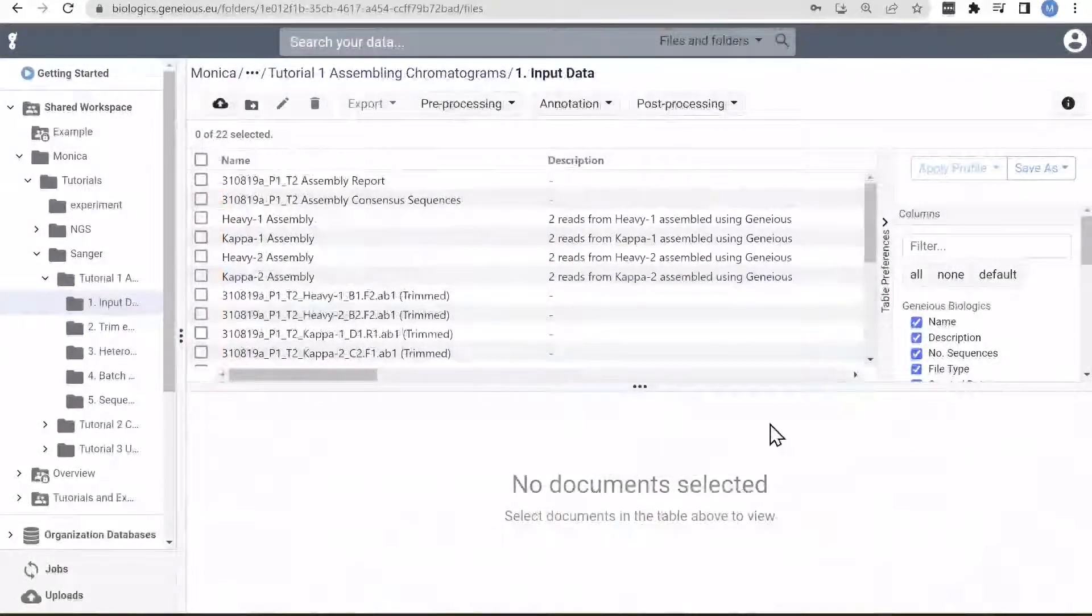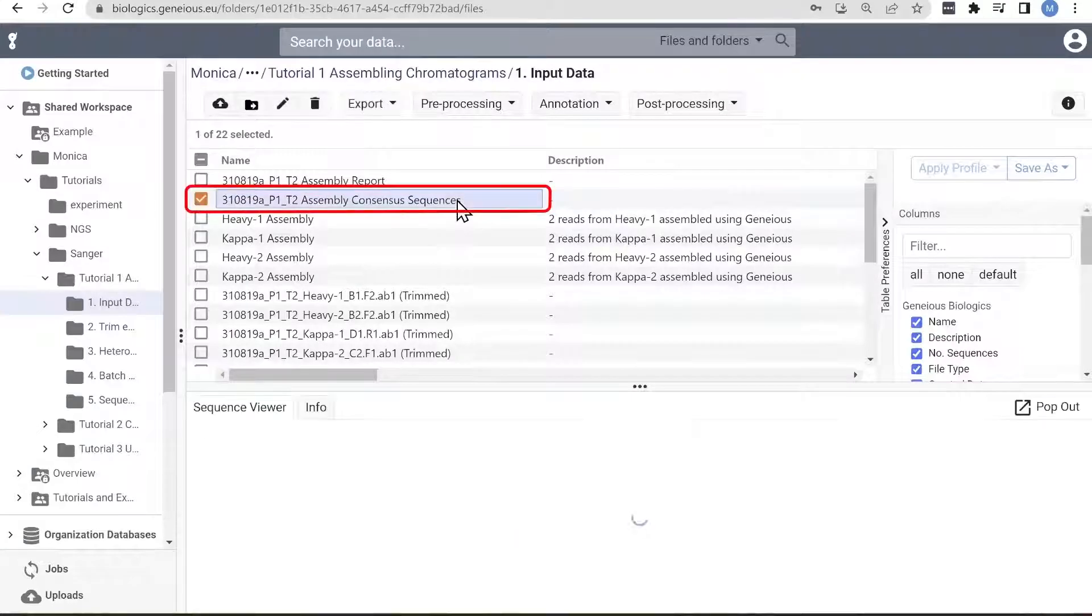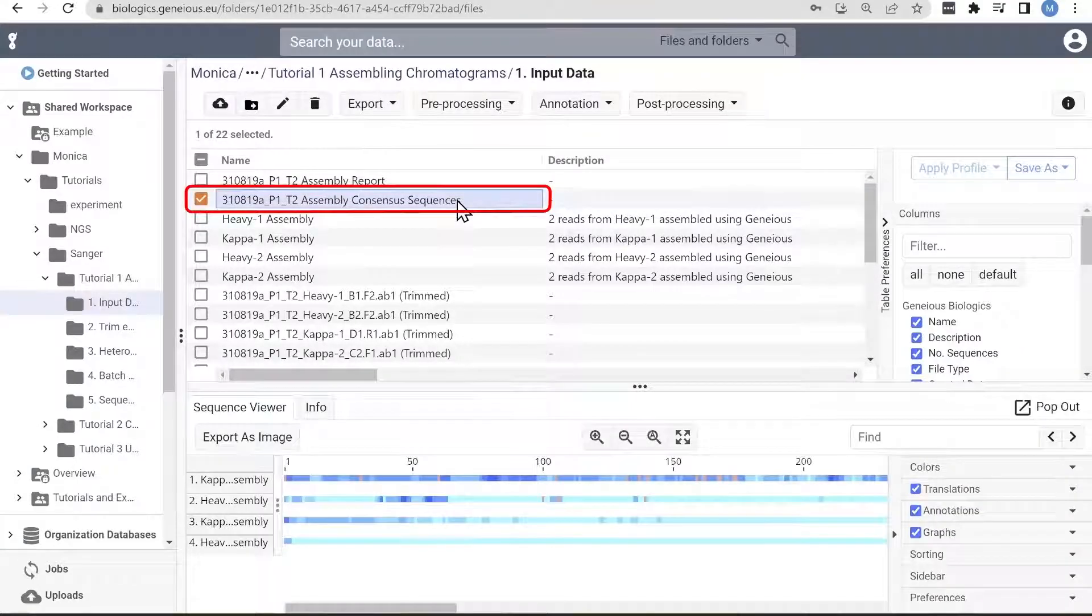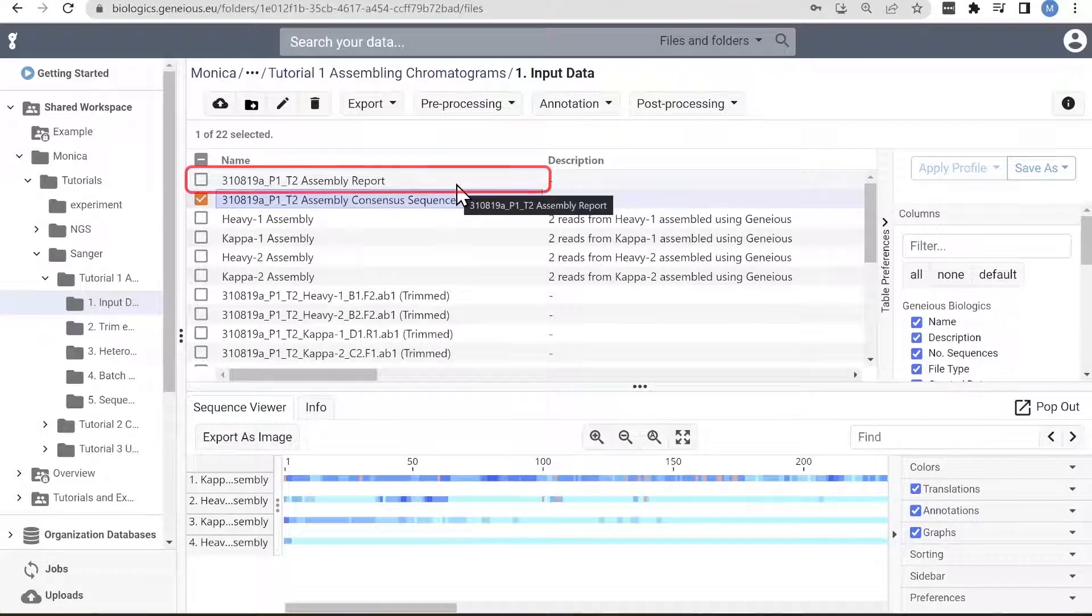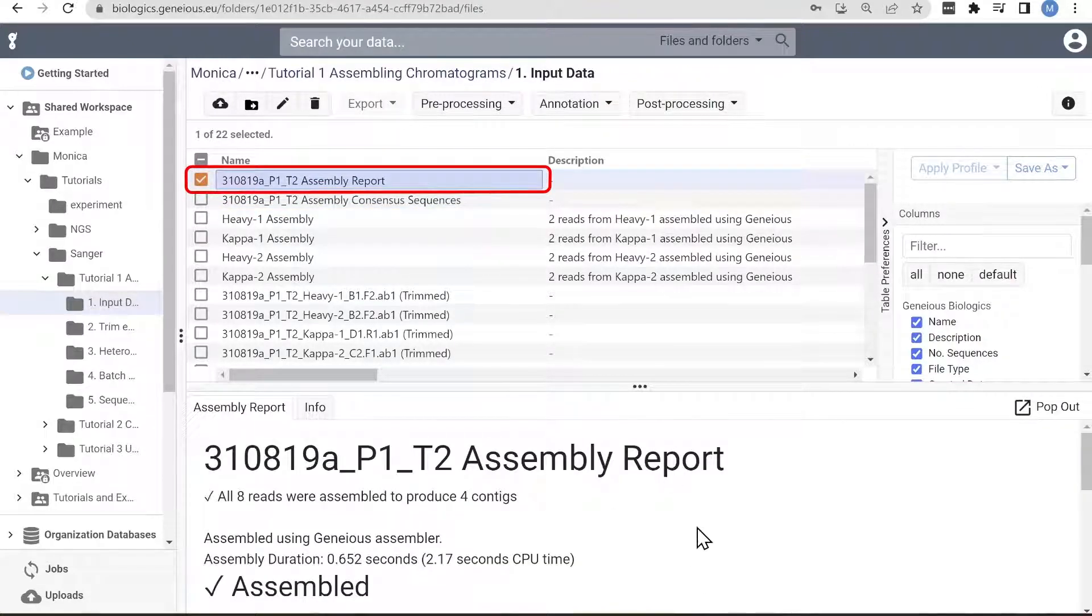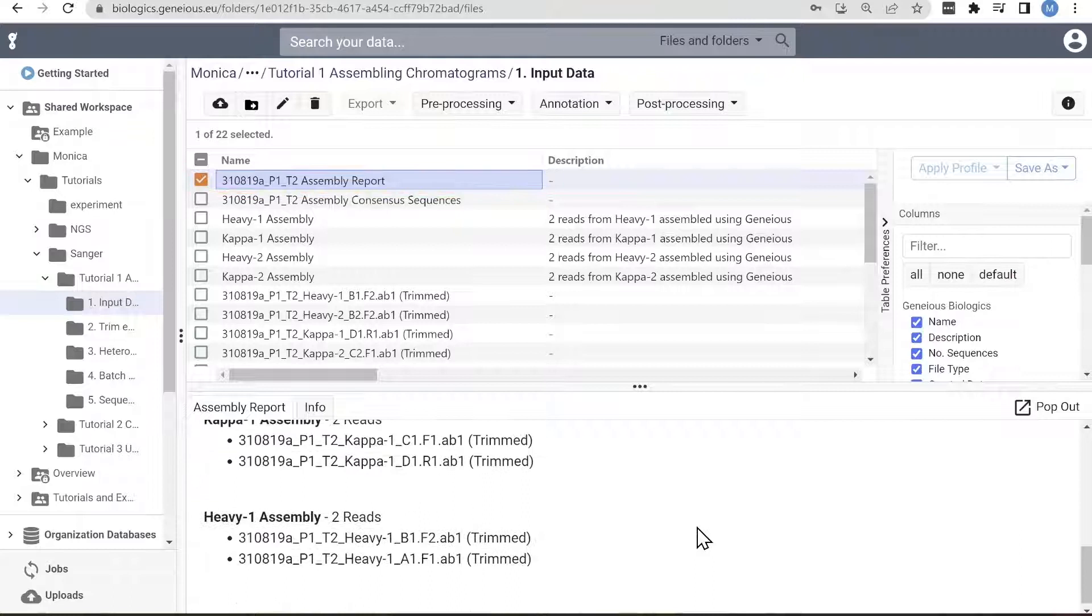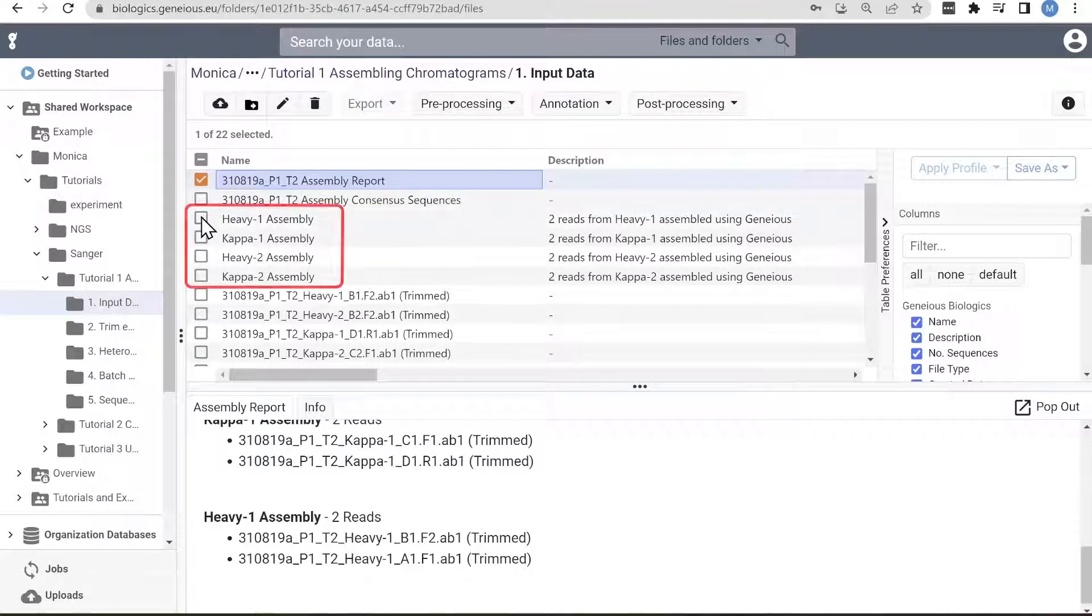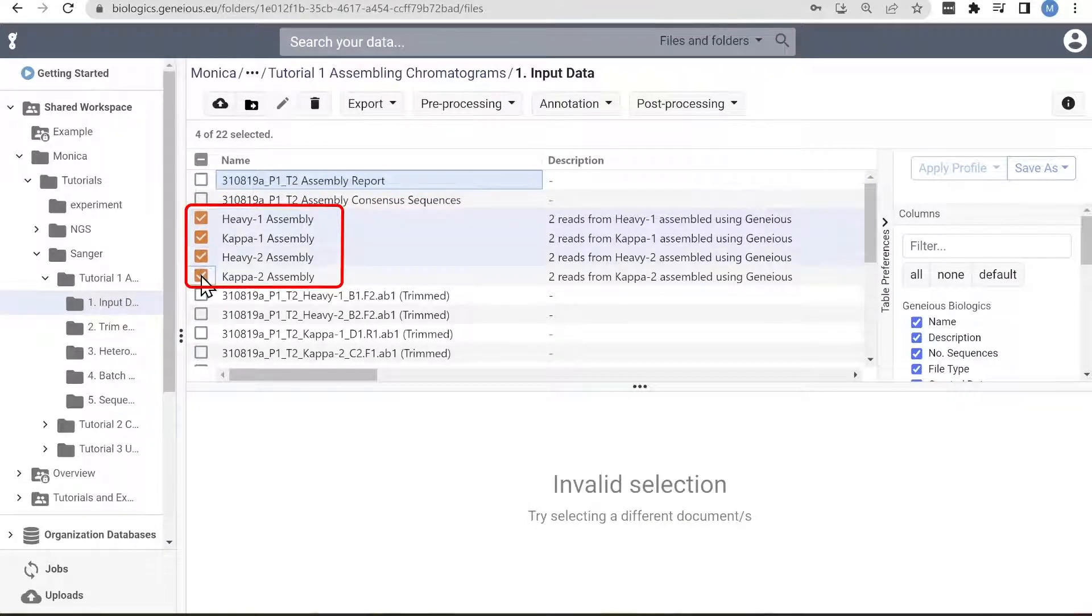Here are the results, a total of six documents. One is a document containing all four of the consensus sequences in a list, which is the document you'll annotate. One is the summary report of how many sequences were successfully assembled into contigs. And four are the successfully aligned and merged individual contigs.